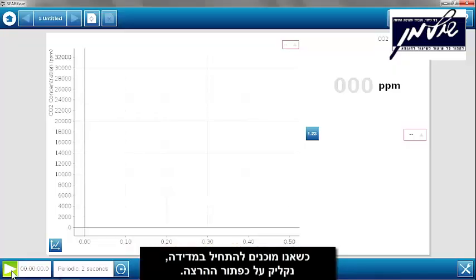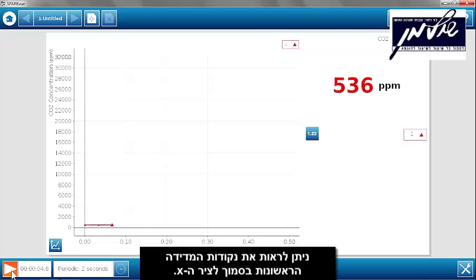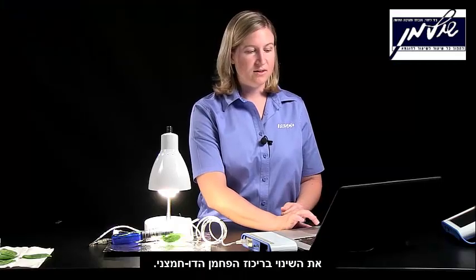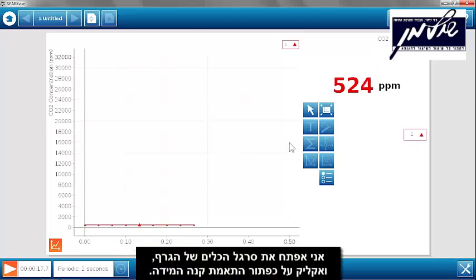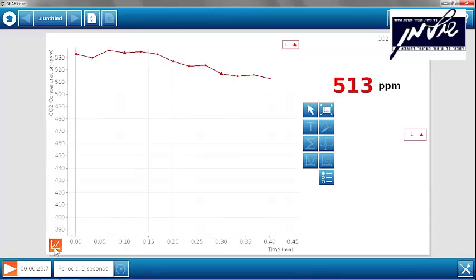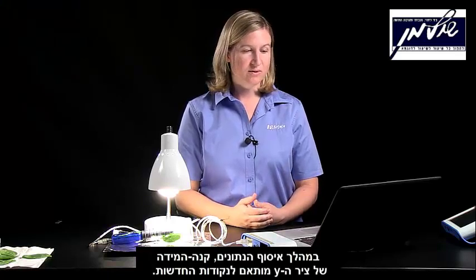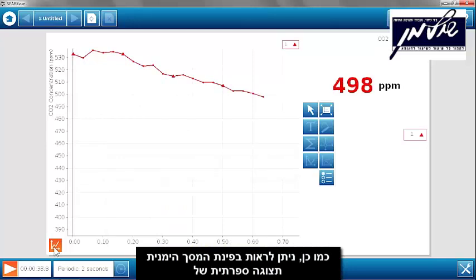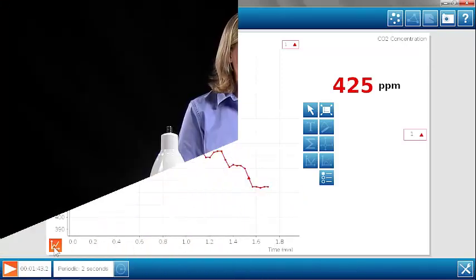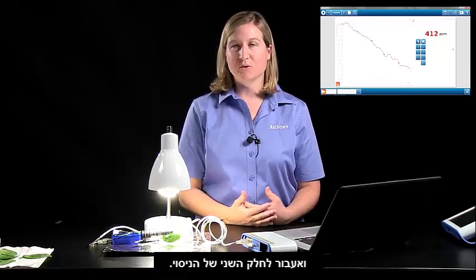When we're ready to collect data, we're just going to hit the play button to begin data collection. You can see a few data points being collected near the axis of the graph. We're going to want to scale the axes to see the greatest view of our change in carbon dioxide concentration. So I open up the graph tools and choose the scale axis button. The scale of the y-axis will adjust to the new data points. You can also see in the upper right-hand corner a display of the carbon dioxide concentration in parts per million, and you can see how that is changing as time goes on. For the purposes of today's presentation, I'm going to stop data collection and move on to the second part of the lab.